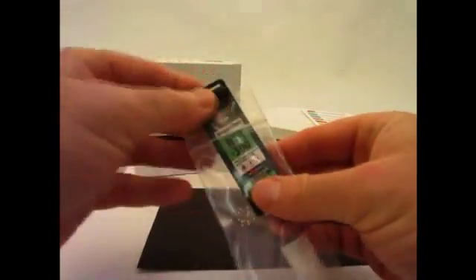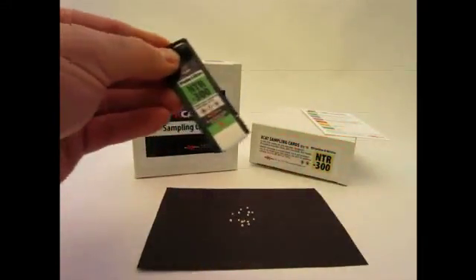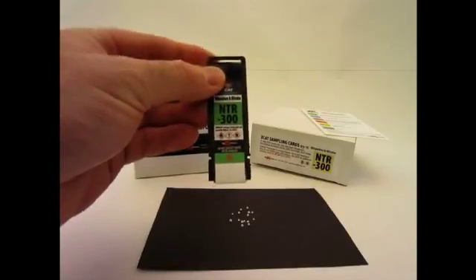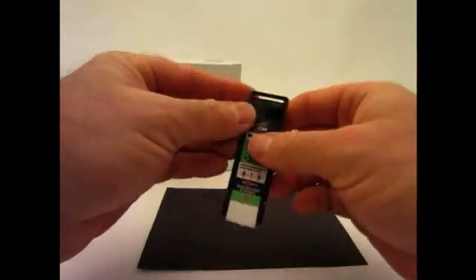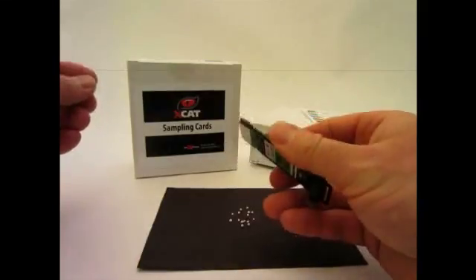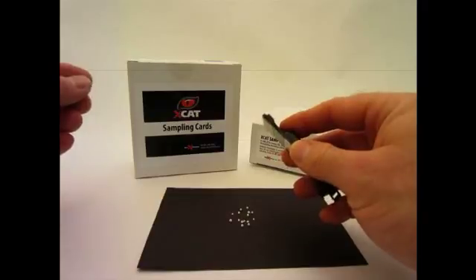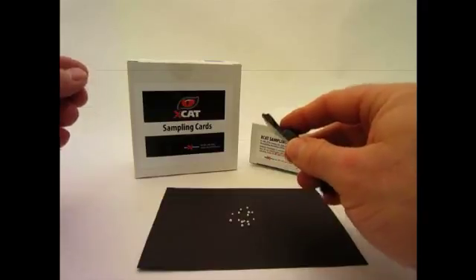Remove the sampling card from its bag. Note that the NTR card does not have any additional instructions printed on it. Since the substance consists of small spherical particles, a grinding method will be used to reduce it to powder, and then the powder will be collected.